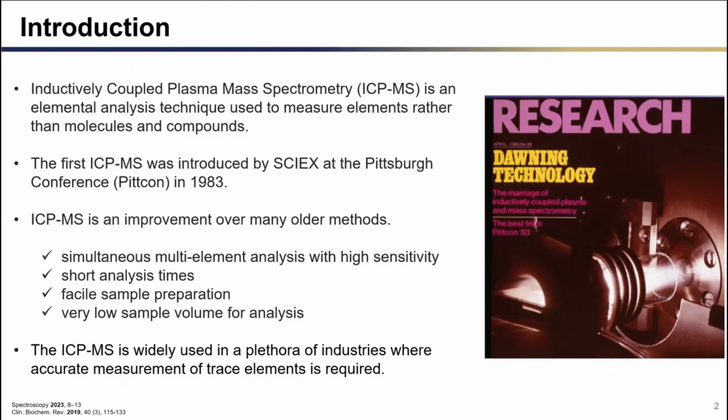Now, many of these older methods have limitations in detection limits and multi-element analysis compared to the ICP-MS, which allows multiple elements to be analyzed simultaneously in a single analysis with very high sensitivity, short analysis times, and simple sample preparation. And also, you only need a very low sample volume for analysis.